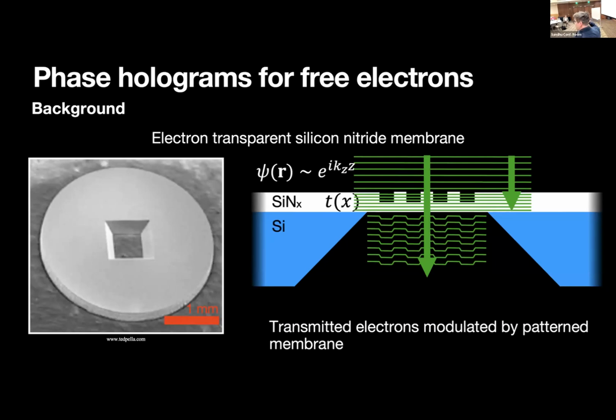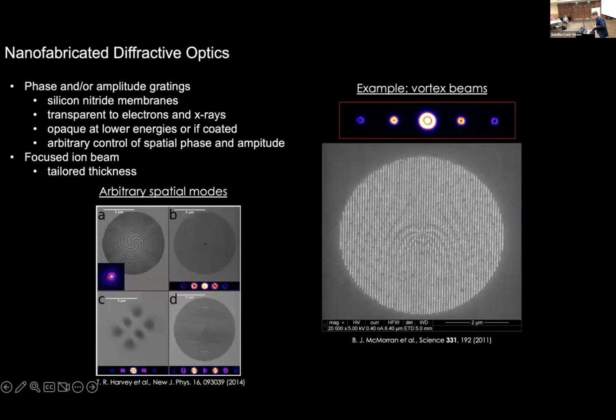And it's so thin, this is a commercial product that's used as a microscope slide for a TEM. So it holds your sample, the electrons pass right through it, it's transparent. And all we're going to do is shift the electron waves as they transit through to coherently print the phase. There's all kinds of things you can do with that.